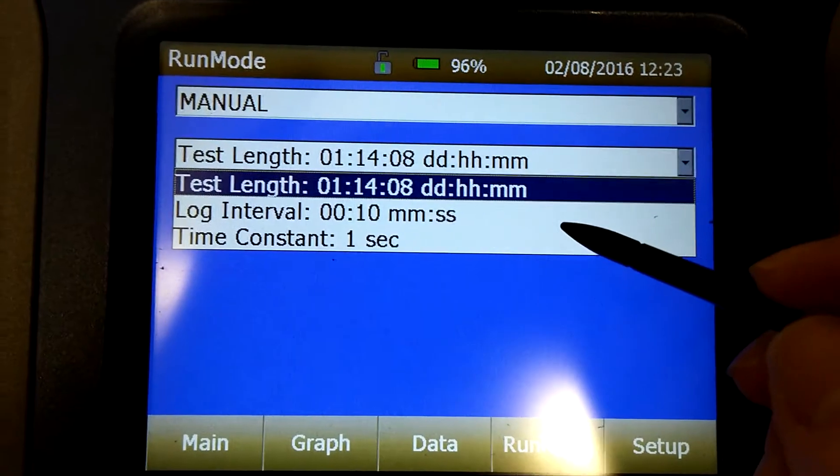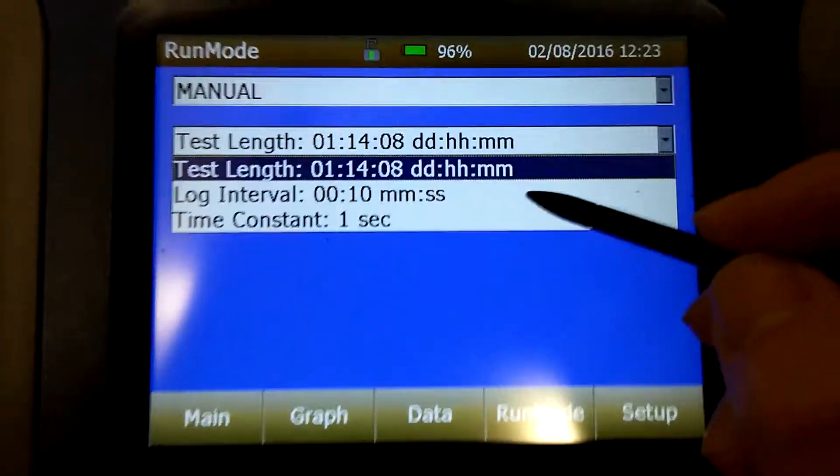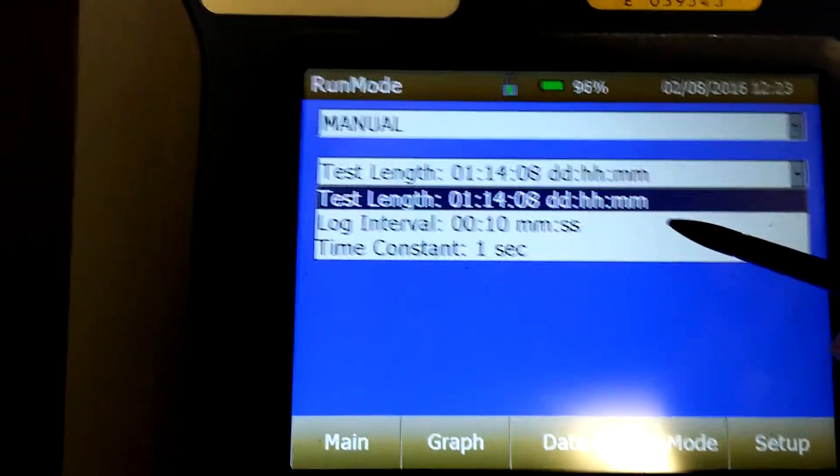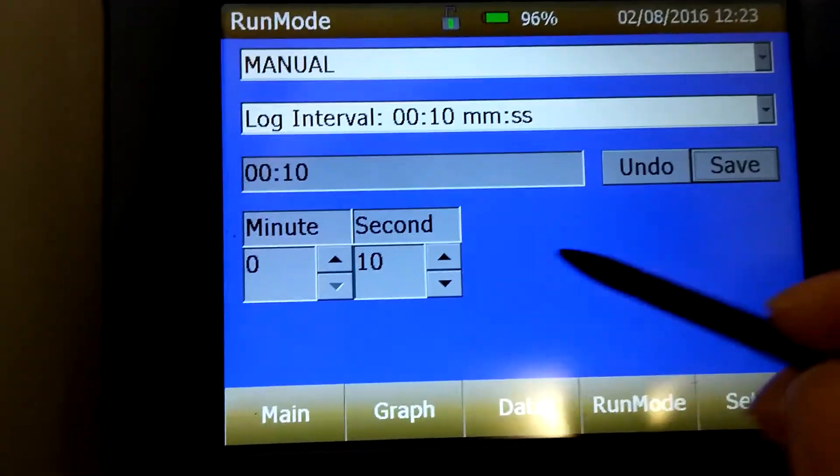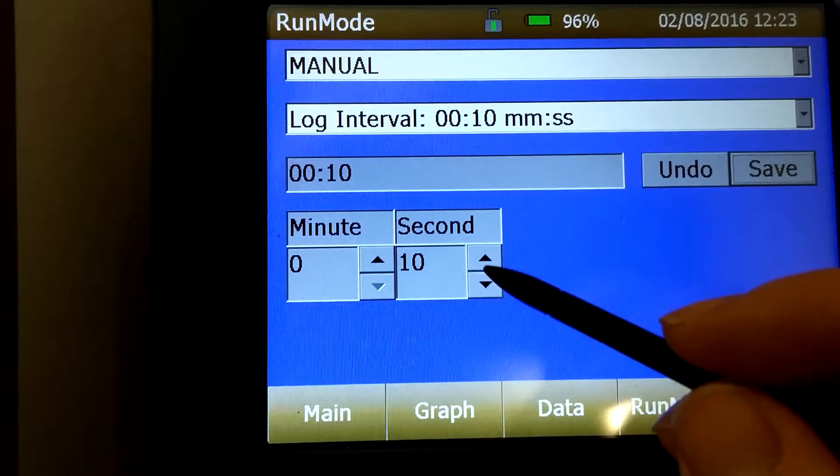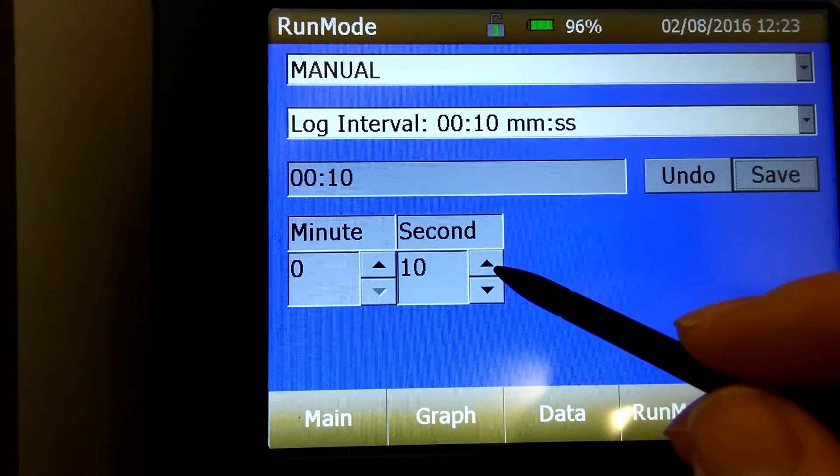For logging interval, chances are you're going to be using 10 seconds, but you may use up to a minute.